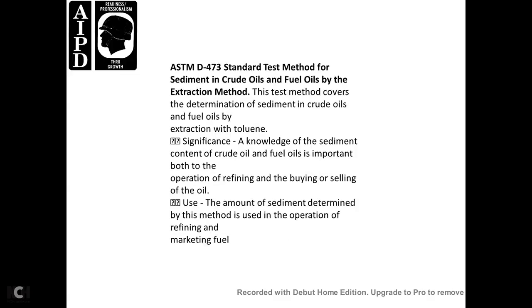ASTM D473, standard method for sediment in crude oils and fuel oils by the extraction method. This test method covers determining sediment in crude oils and fuel oils by extraction with toluene. Significance and knowledge of the sediment content of crude oil and fuel oil is important for both operation, refining, and the buying and selling of oil. The amount of sediment determined by the method is used for operation, refining, and marketing of fuel.